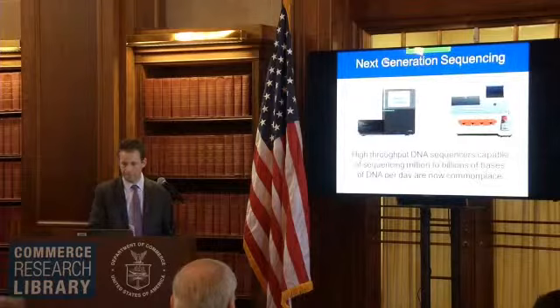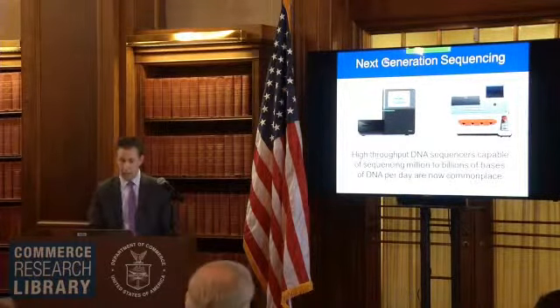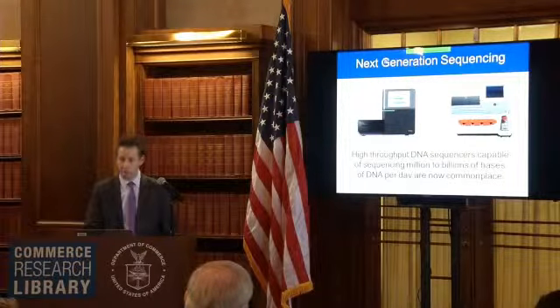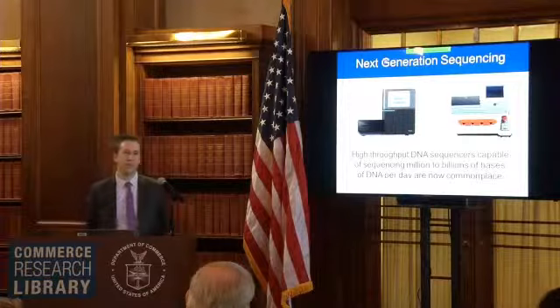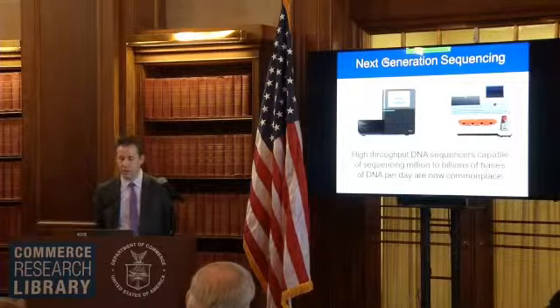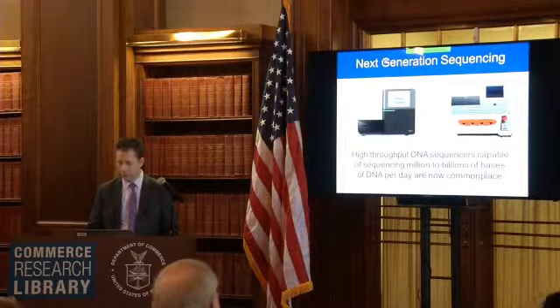I made a couple mentions of next generation sequencing. Since about 2005 or so, there have been these high throughput sequencing instruments that are capable of doing millions or billions of bases per day. These are now commonplace, especially in clinical testing.